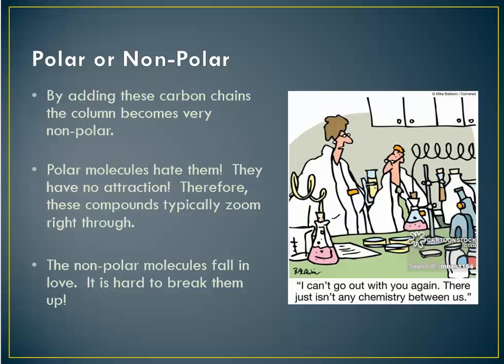How do they hang out on the surface of the particle? How long are they hanging out? What are they doing while they're there? And what type of mobile phase is coming into the picture to kind of shove them along through the tunnel so they can go out of the other end?